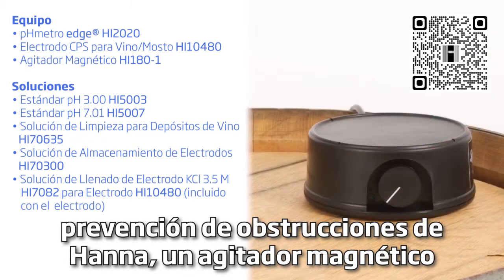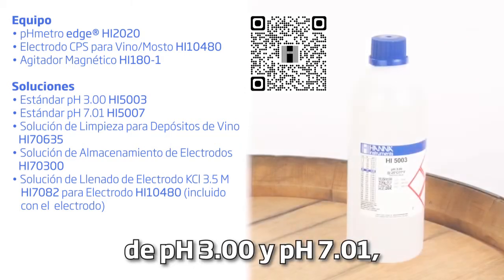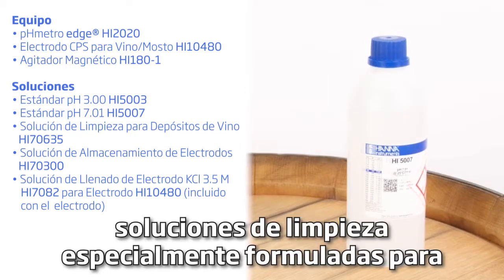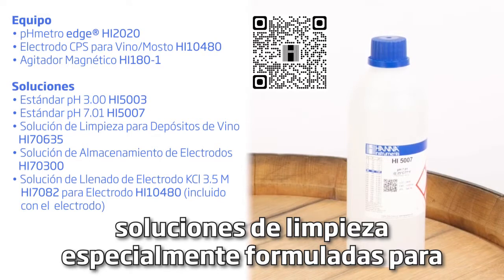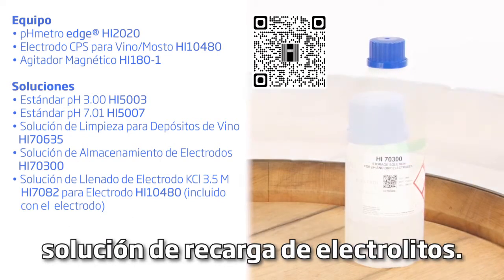A speed-safe compact magnetic stirrer. The kit comes with pH 3 and 7.01 calibration buffers, cleaning solution specially formulated for wine deposits, electrode storage solution, and electrolyte refill solution.